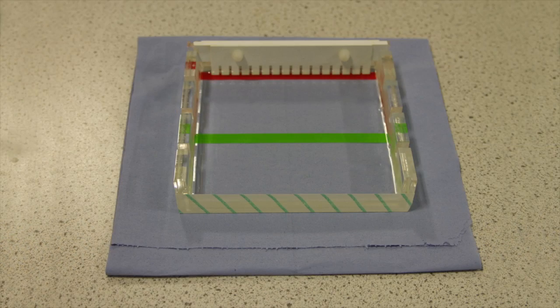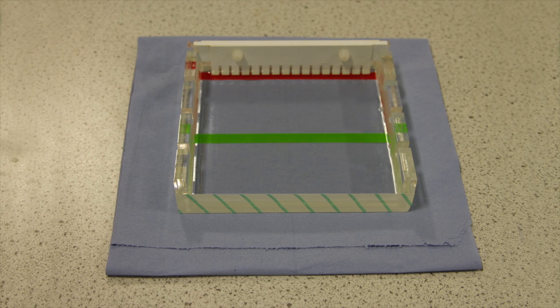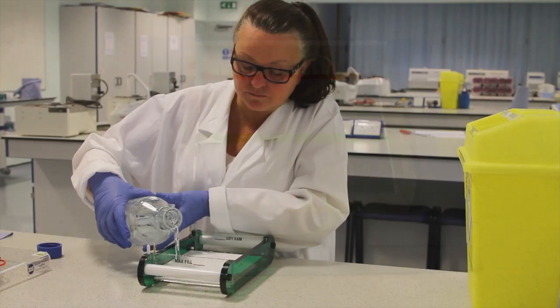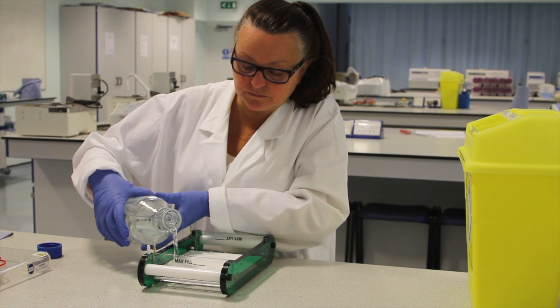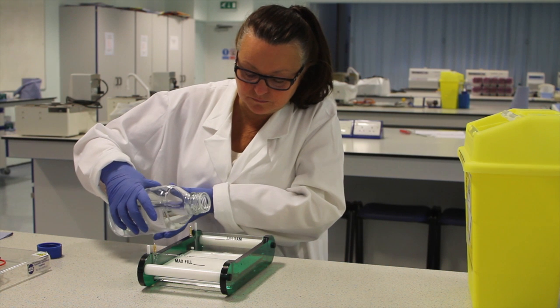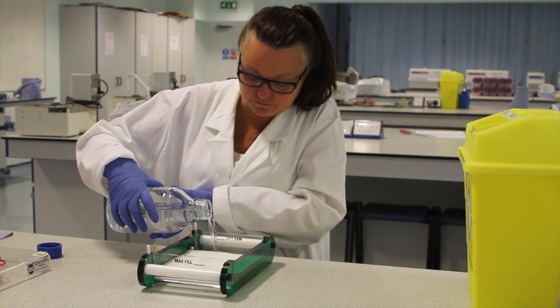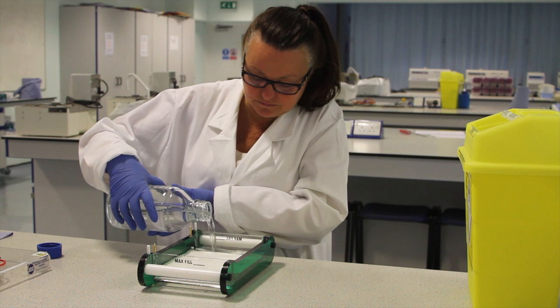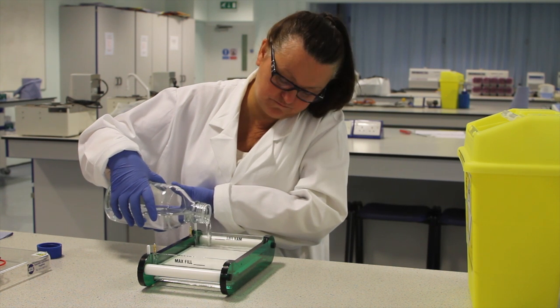Leave the gel to set at room temperature. This may take 20 to 30 minutes. Once the gel is set, prepare the gel running tank by filling the chambers with a running buffer. This will either be the TAE or TBE buffer used to prepare the gel. Take care not to overfill the tank.